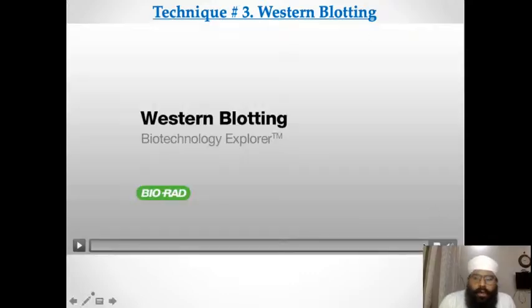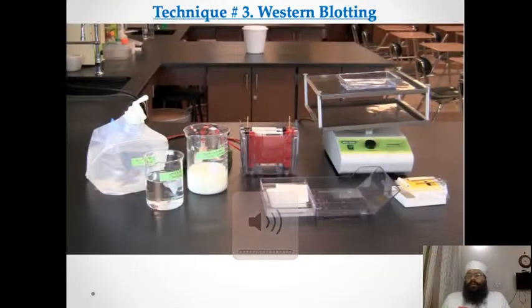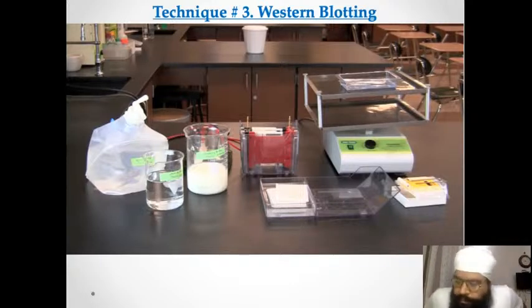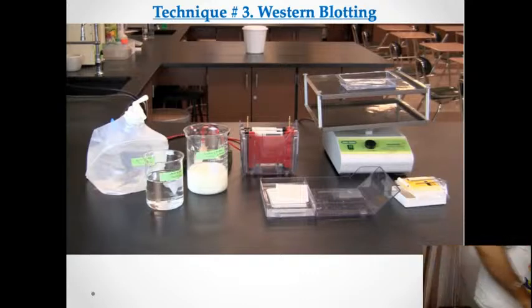So we will go now to one video about Western blotting, about a 10 minute video. In this video, you will learn how to perform a Western blot. A Western blot can be used to identify specific proteins in a sample and provide information about the protein size and relative abundance in the sample.